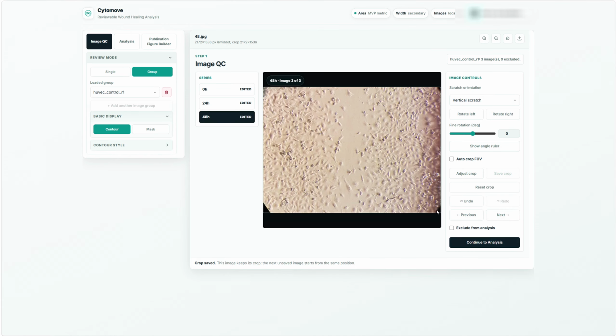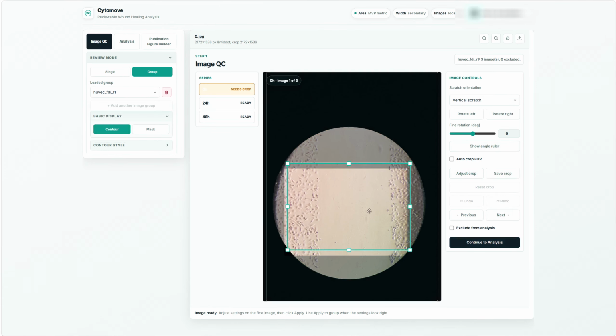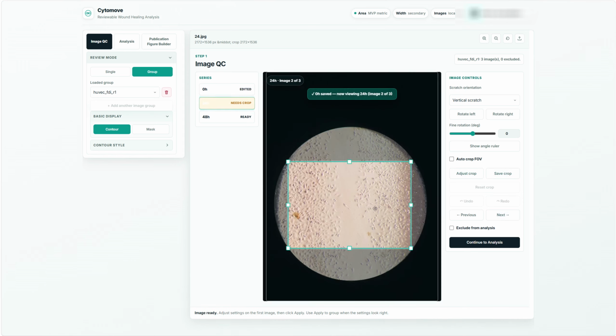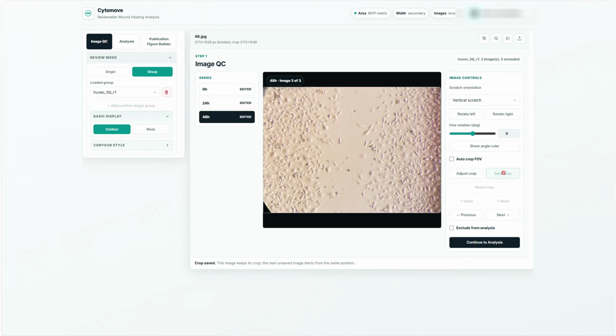The rectangular preview shows the analysis-ready crop. A second QC pass then repeats the same crop review. The corrected field opens in analysis, ready for boundary review.